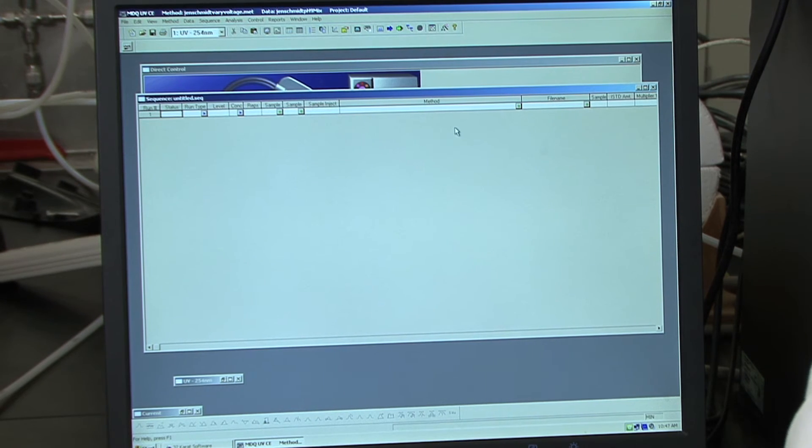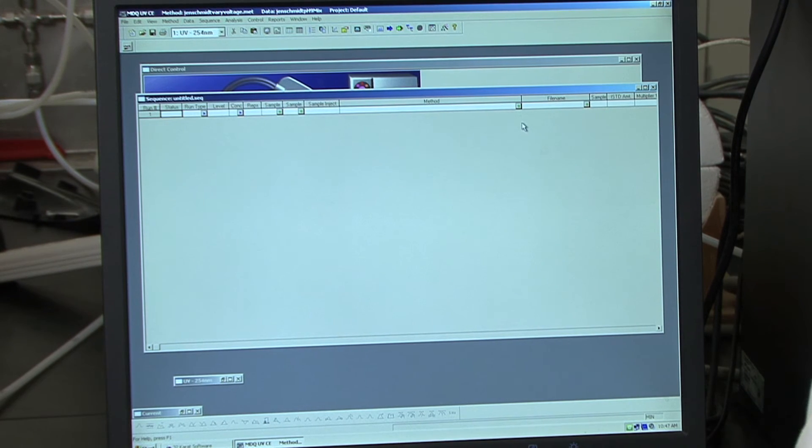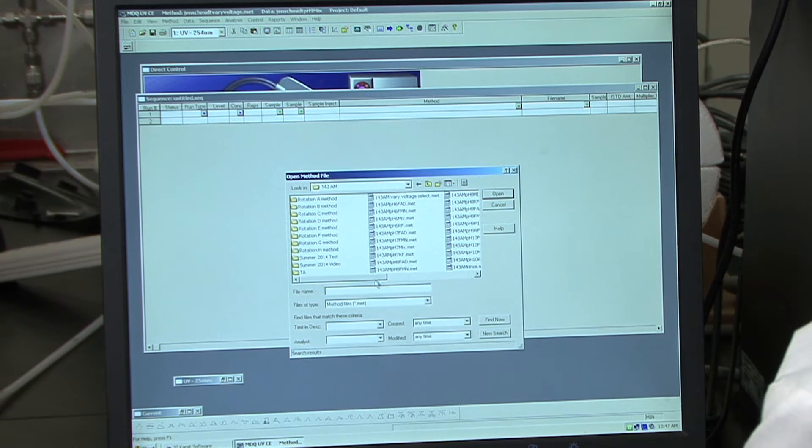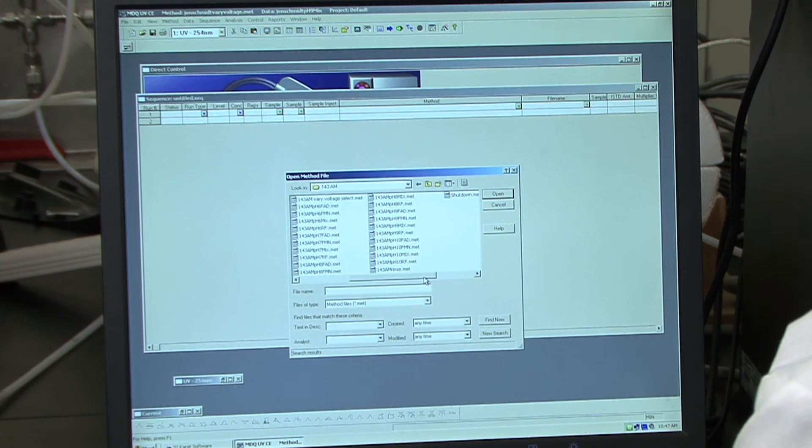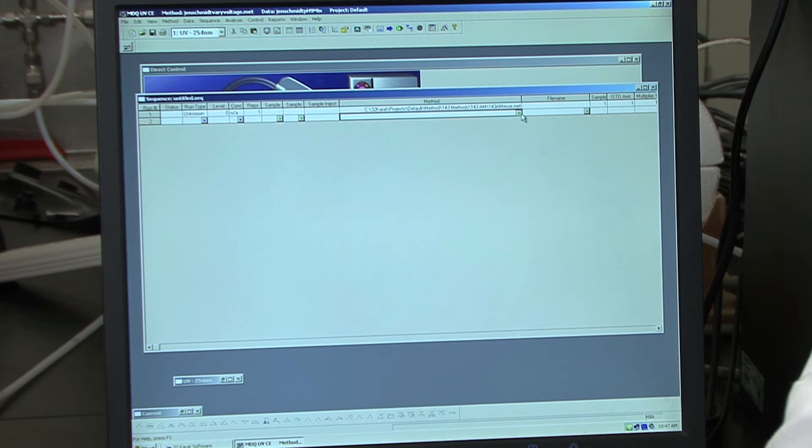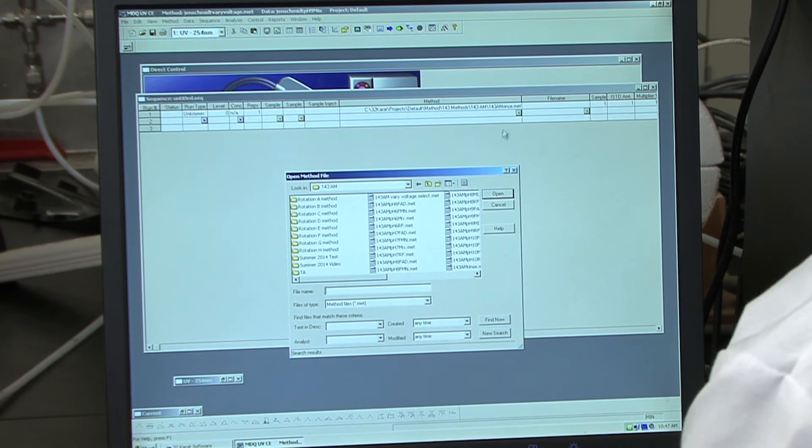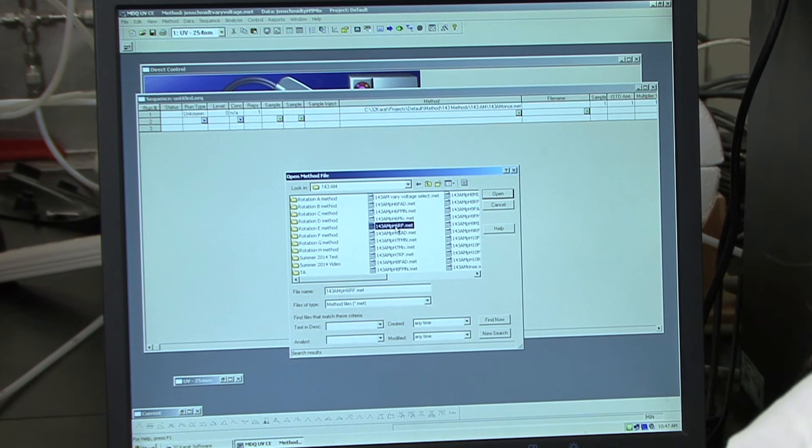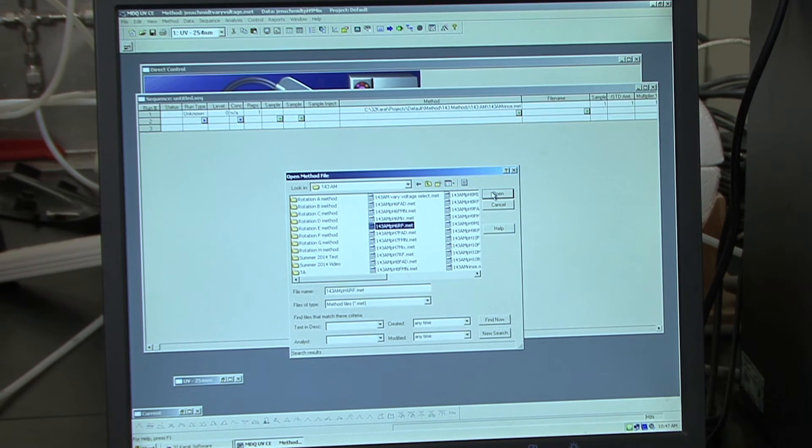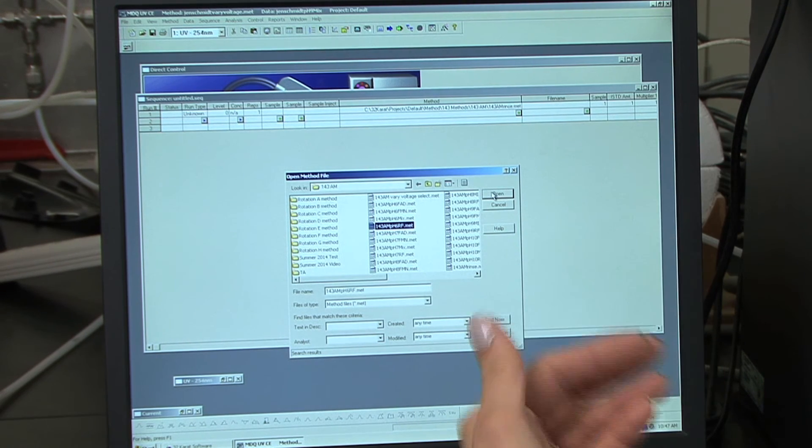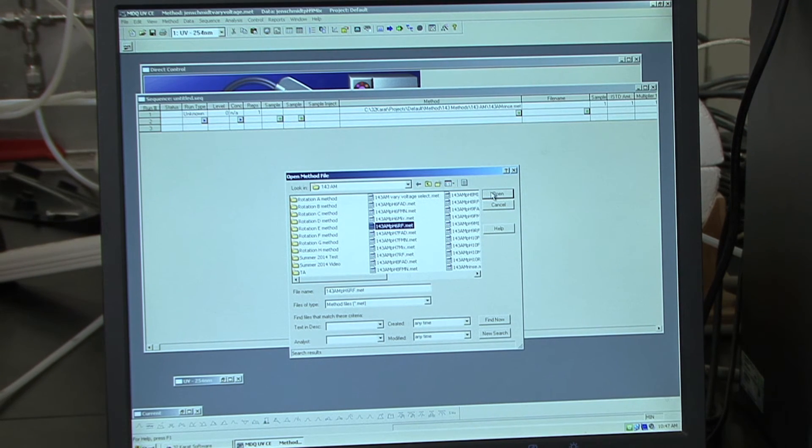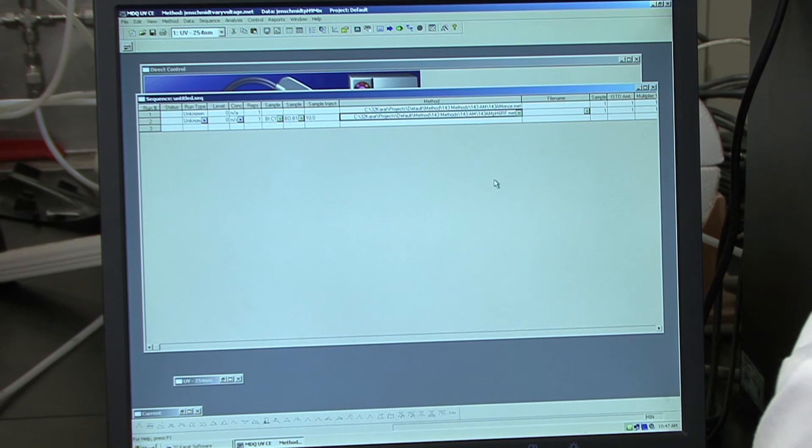So we first want to load our method here. So our first sample that we want to inject is a rinse again. I'm in the am folder. I'm going to choose the rinse. The next one that we want to load is going to be our pH 6 RF sample. So we want 143 am pH 6 RF. We're going to start at pH 6, and then you're going to load pH 7, pH 8, pH 9, and then last pH 10. So we're going to start at the low pH and end with the high pH.